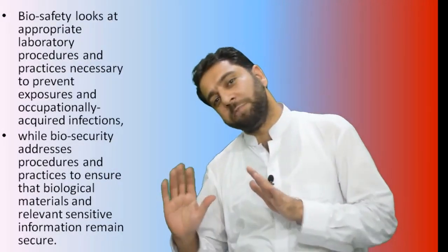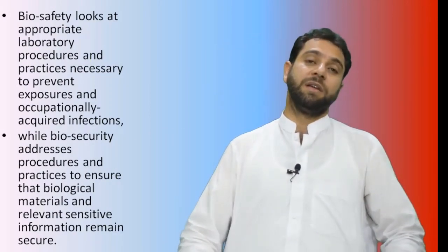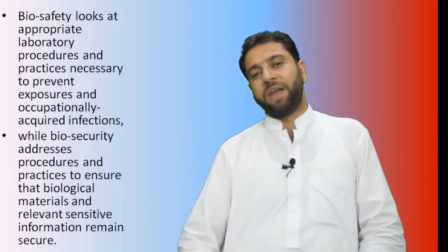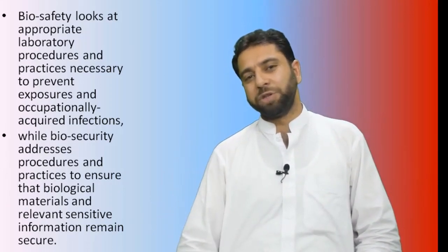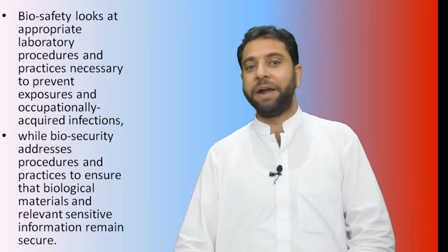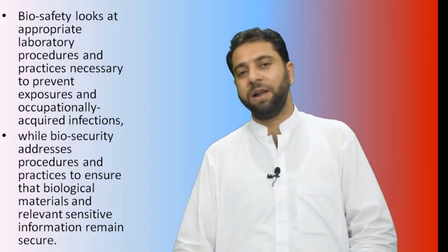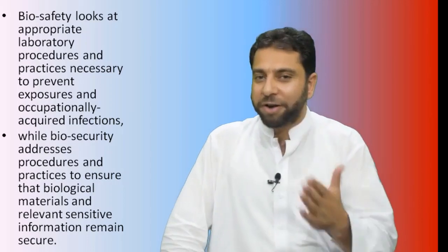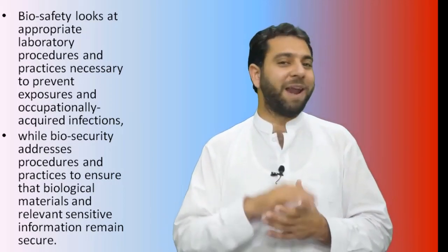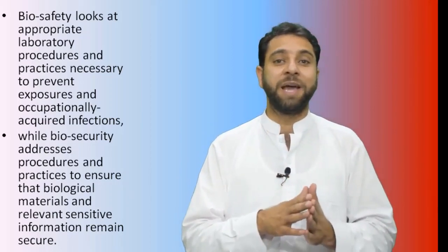Concluding the principles of biosafety and biosecurity: biosafety looks at appropriate lab procedures and practices necessary to prevent exposures and occupationally acquired infections, while biosecurity addresses procedures and practices to ensure that biological materials and relevant sensitive information remain secure.